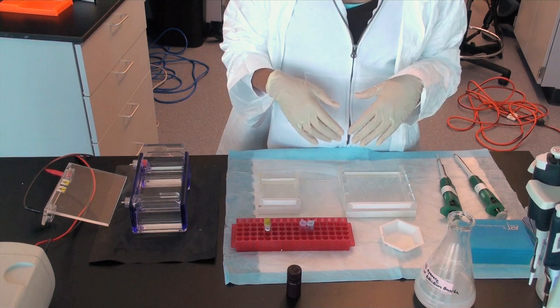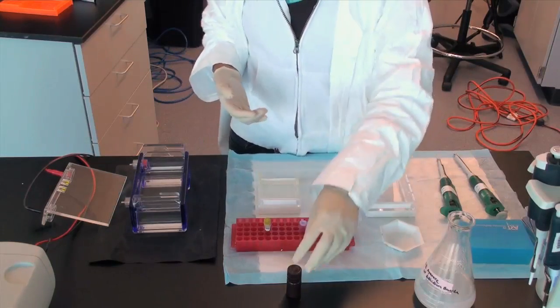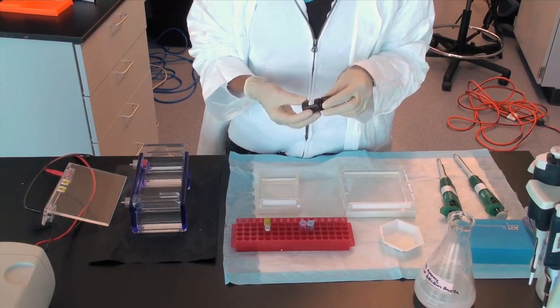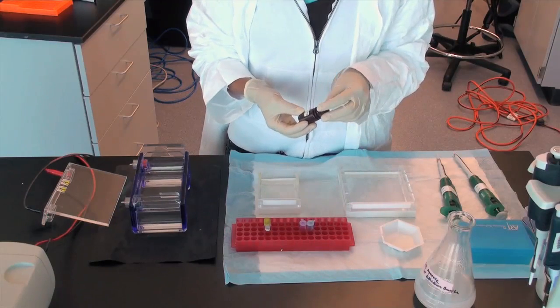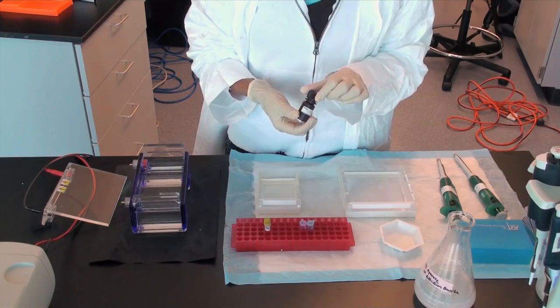There are a number of ways to stain your DNA in order to visualize it on a UV box. If EtBr, ethidium bromide, is used, then approximately 4 microliters of a 10 milligram per milliliter stock of EtBr is added to a 100 milliliter solution of agarose and TAE or TBE buffer.